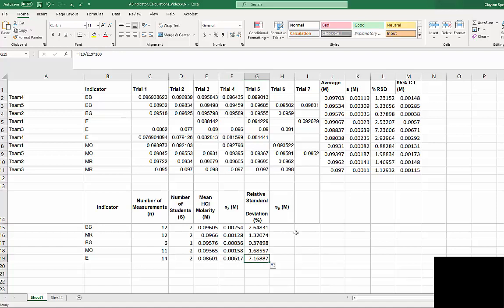And we can see that even more clearly when we look at the percentages. So we've got about 2.5%, 1 1/3%, about 1/3%. Again, 1 and a little more than a half, 1 2/3%. And about 7%. So that one's pretty big. So not only is the erythrocene molarity different looking than the others, but the standard deviation also seems kind of high. All right, so let's use that special formula to calculate the pooled standard deviation.